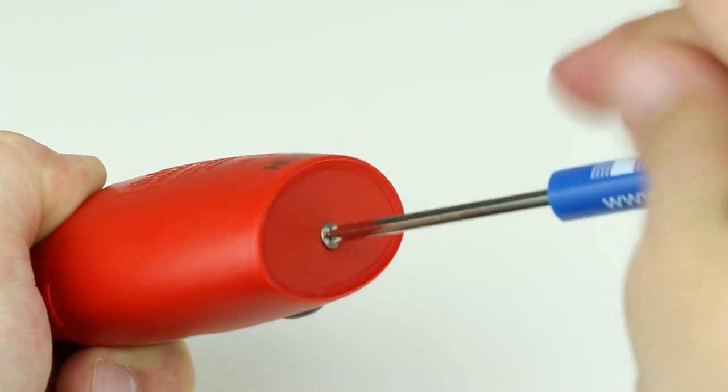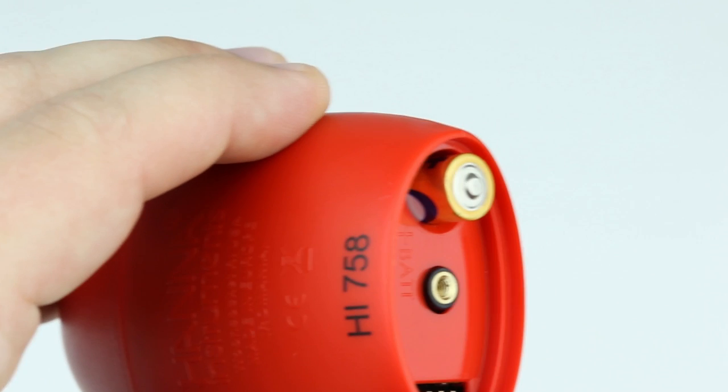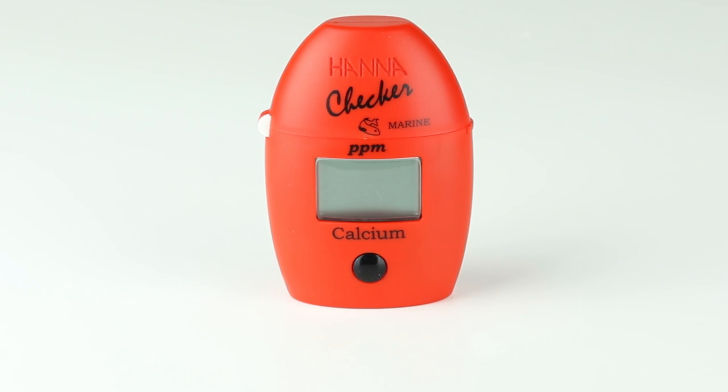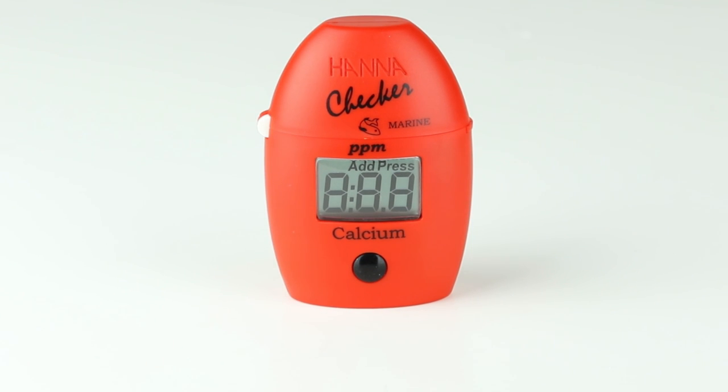When you first receive your checker, install the battery in the compartment on the underside of the meter. The HI-758 is designed to make testing quick and easy. Press the button to power the meter on. Notice 'Add C1' appears on the screen — you're now ready to begin testing.